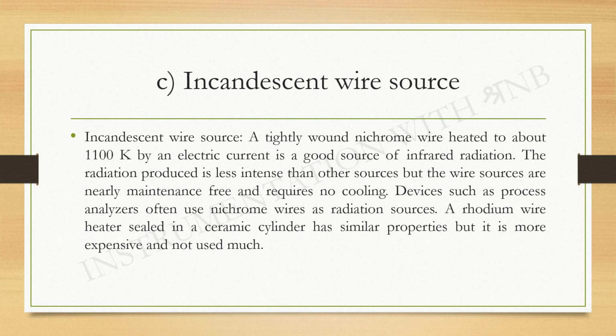As you have seen, in the Nernst glower, rare metal oxides are used, and it also has negative resistance, so it cannot be operated at room temperature.